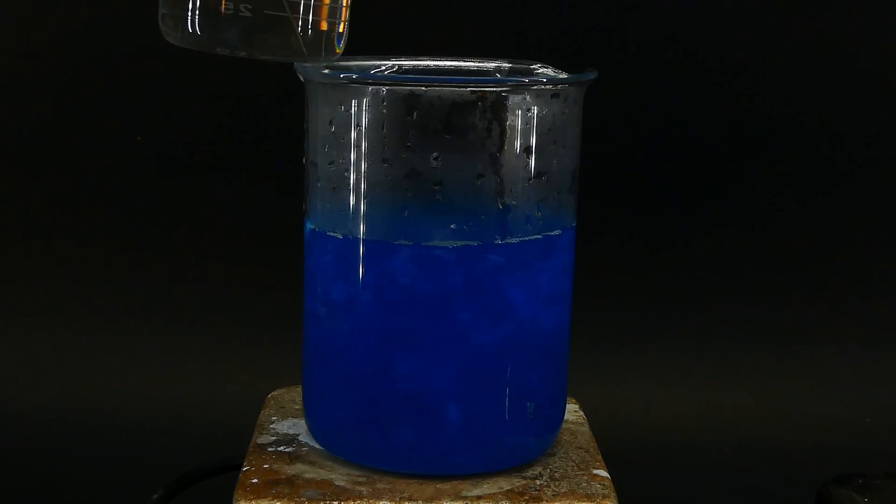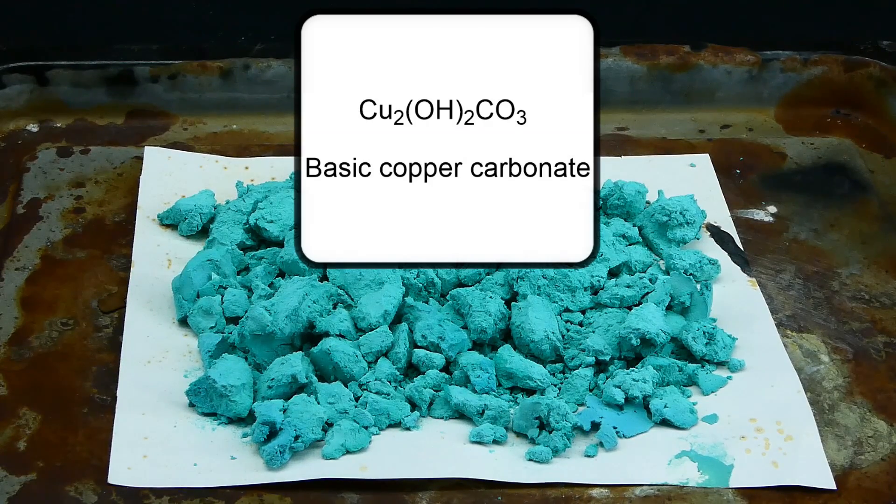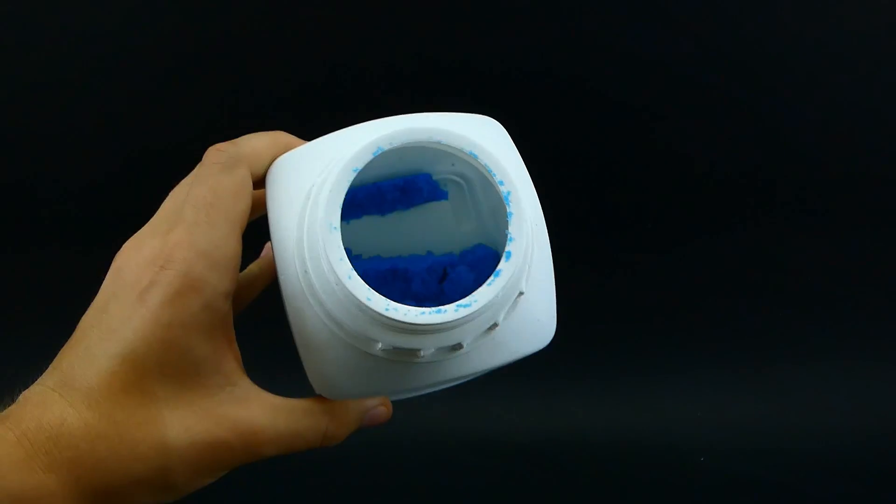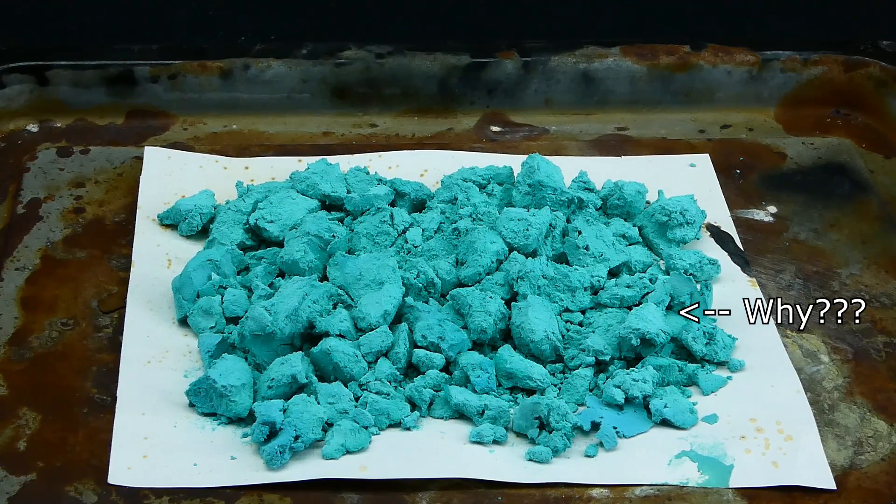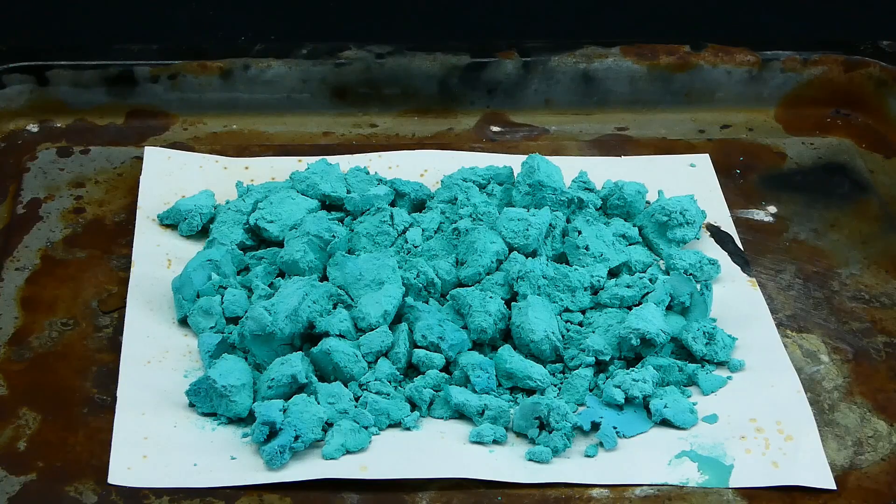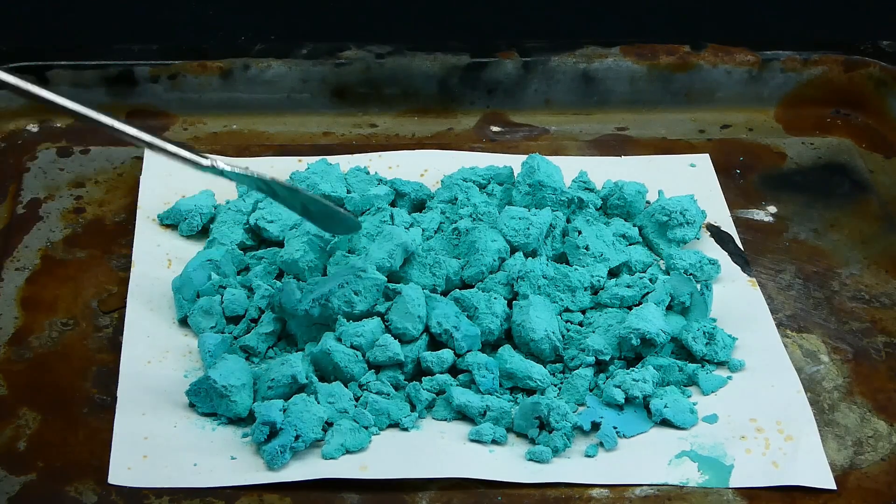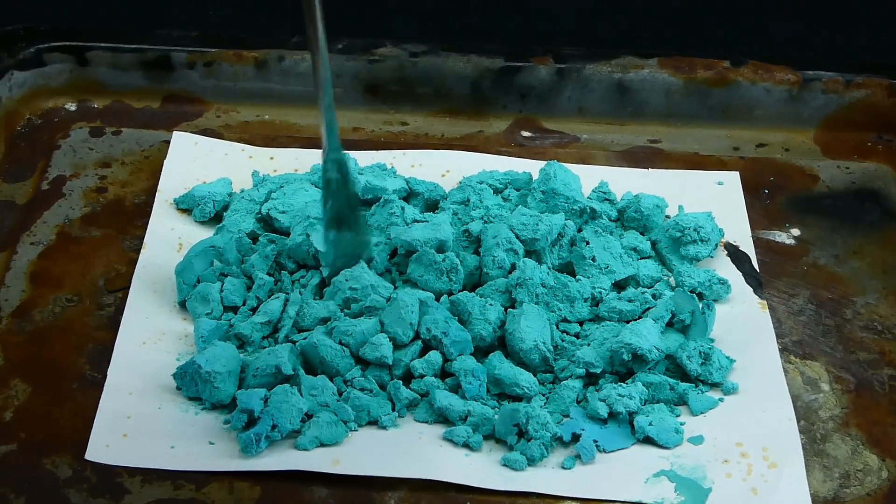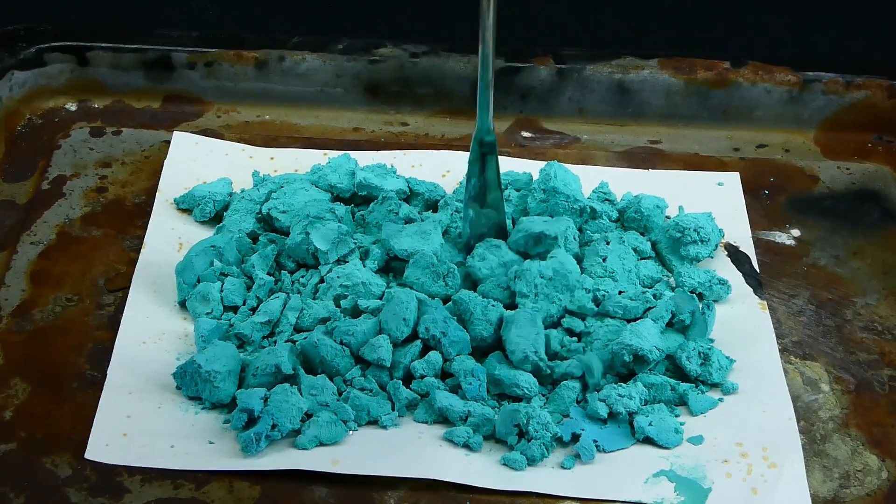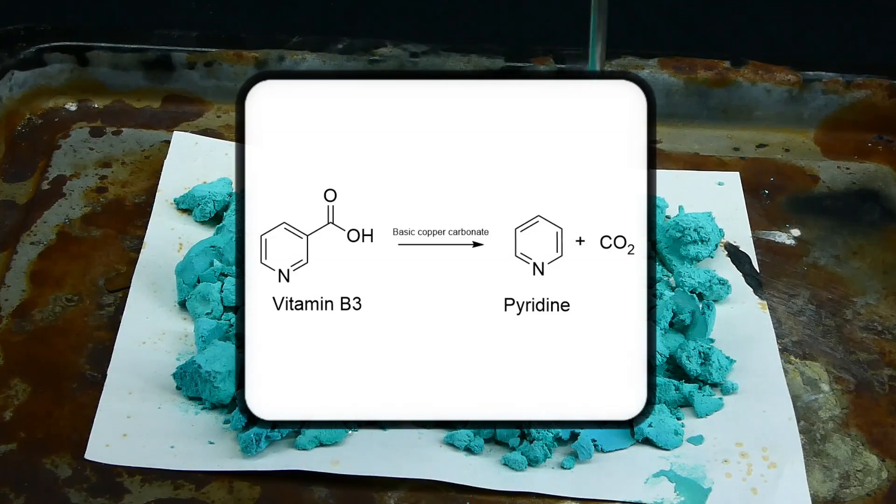In this short tutorial video, I am going to show you how to easily prepare basic copper carbonate from household baking soda and copper sulfate. But why would I even want basic copper carbonate in the first place? Well, it not only has a nice color, but it is also really useful in many chemical reactions mainly as a catalyst, and I will be using it to turn some vitamin B3 into pyridine in a future video.